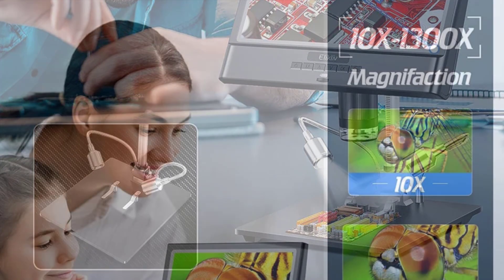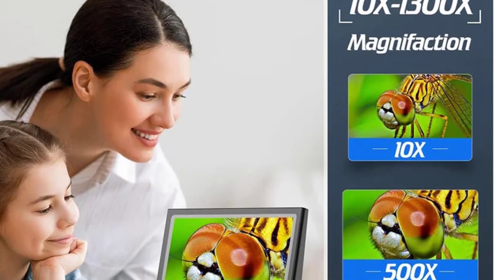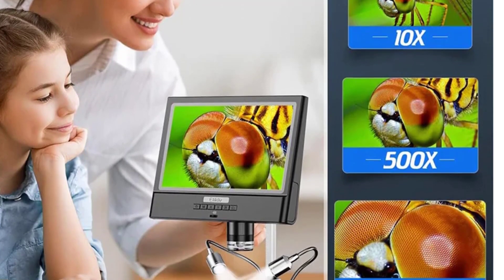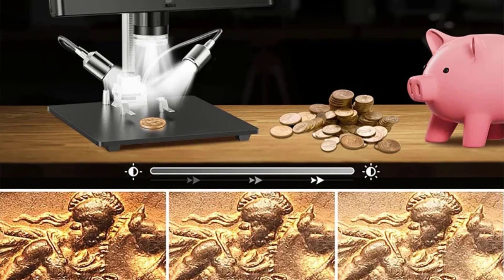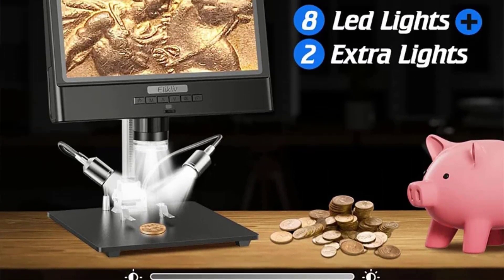Equipped with a 10-inch LCD screen display, the EDM-12 delivers high-definition imaging, allowing users to explore the microscopic world with exceptional clarity. The 500x to 1500x magnification ratio provides a wide range of magnification options, making it suitable for various tasks, from intricate soldering to detailed quality inspections.